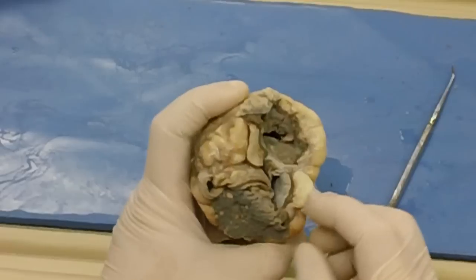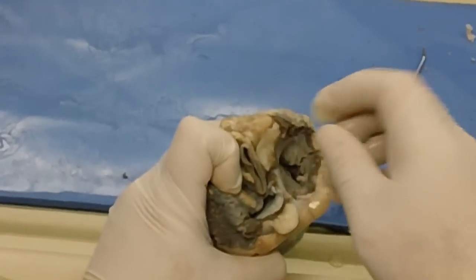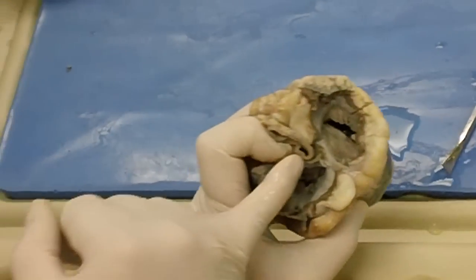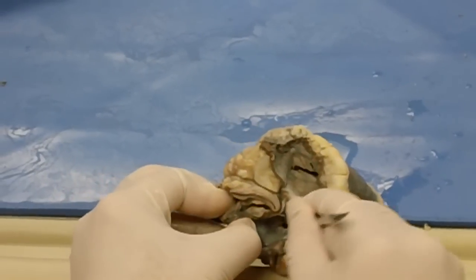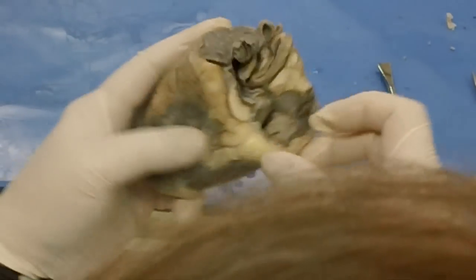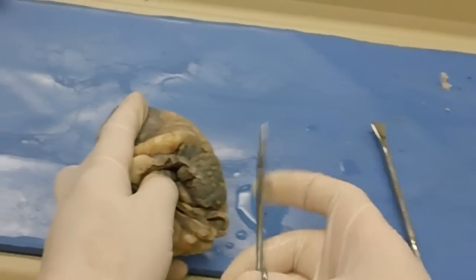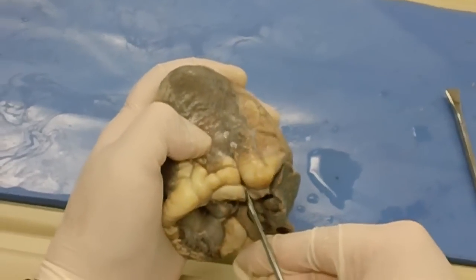Okay? So if this is the right atrium, then the left atrium's got to be where all those vessels come back in, which would be right here. So they've cut off a portion of our left atrium as well. That means that this valve right there, that you can see down there, this one, would be the mitral valve. Okay? So now what we've got to do is go through the left atrium into the left ventricle. This is where it gets a little tough because these scissors are really small.